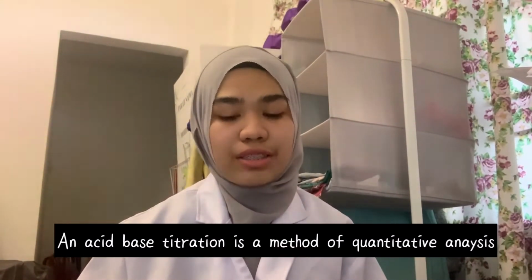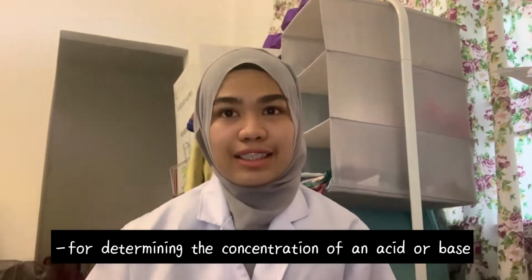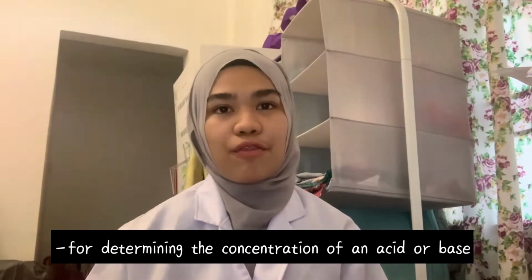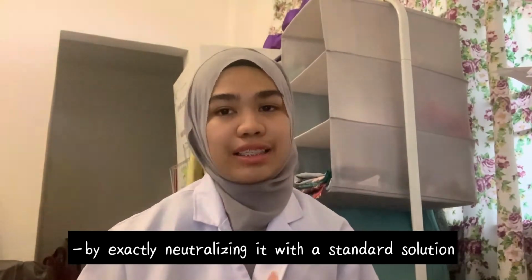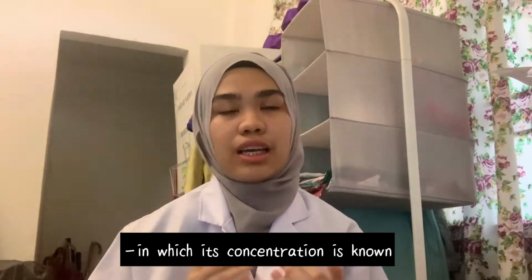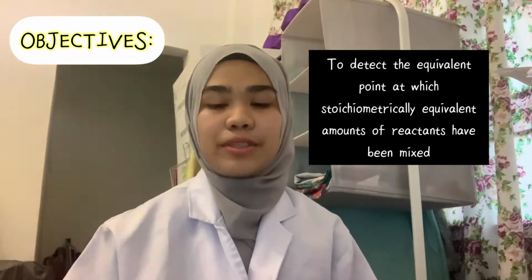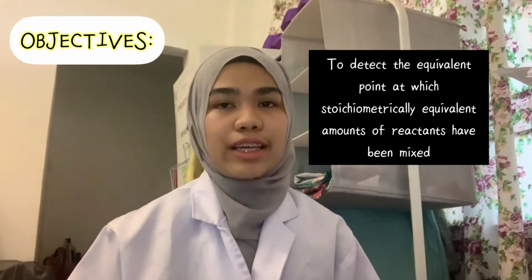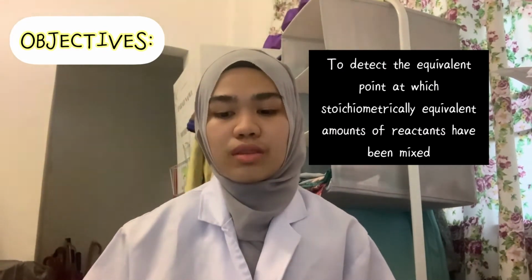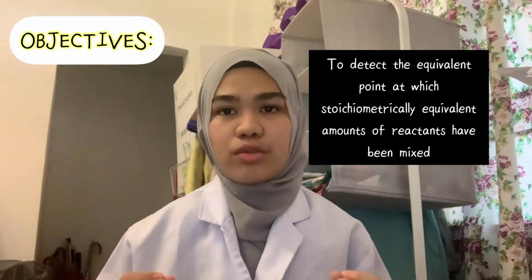An acid-base titration is a method of quantitative analysis for determining the concentration of an acid or base by exactly neutralizing it with a standard solution, that is, a solution whose concentration is known. The purpose of this experiment is to detect the equivalence point at which stoichiometrically equivalent amounts of reactants have been mixed.